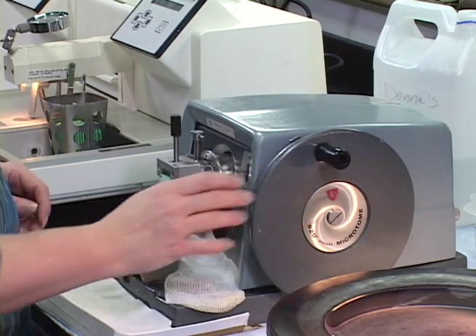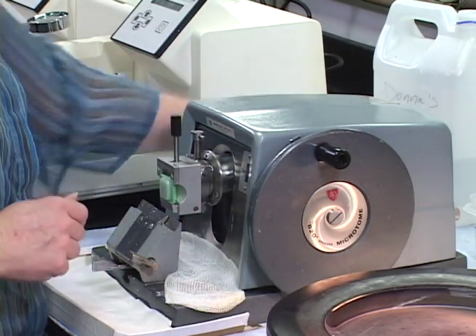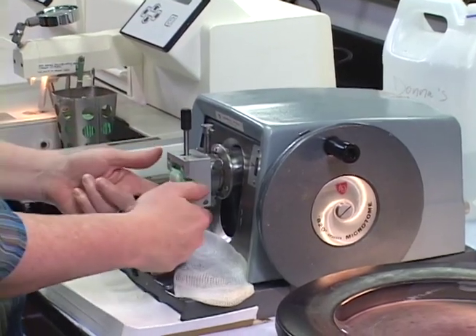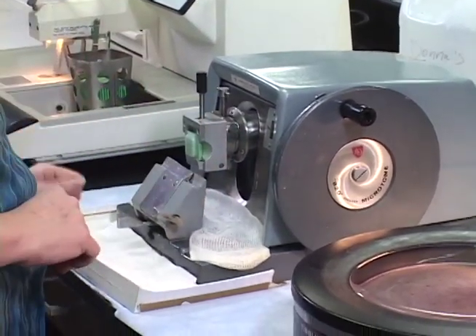Before you get your block in, at any point, you want to try to retract that to where it's not going to come down the blade, and you can chunk your block.